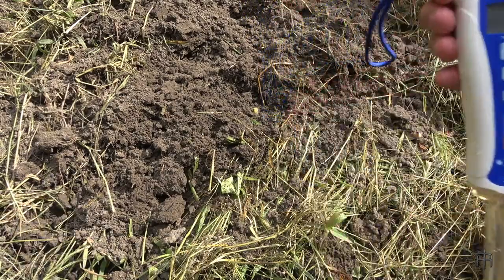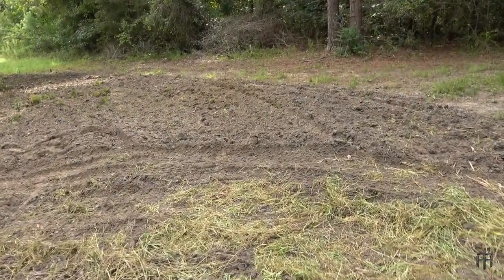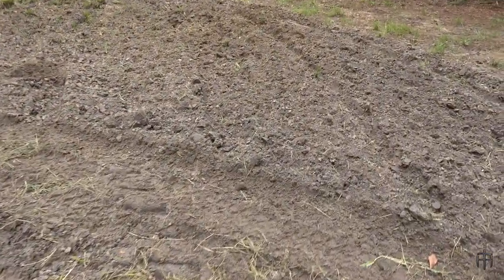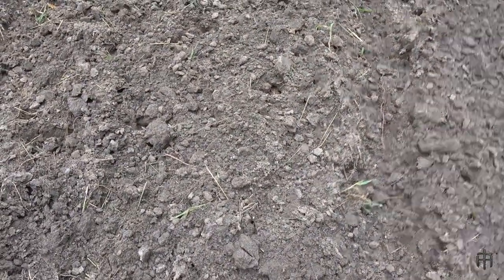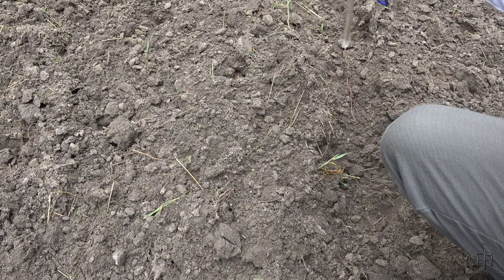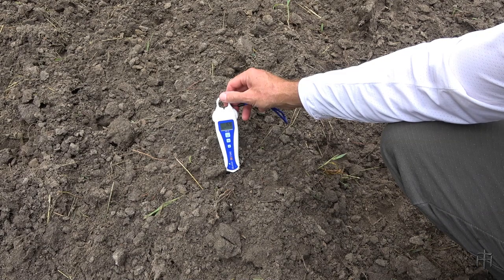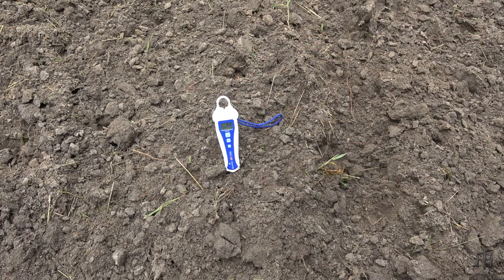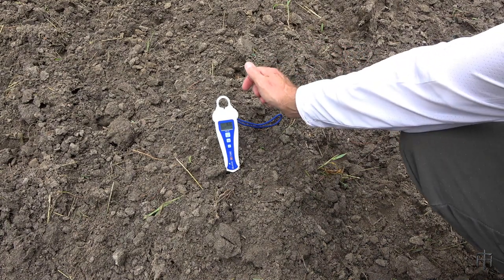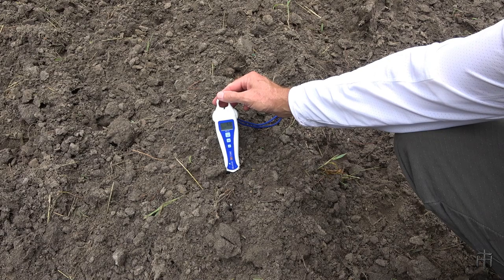Let's go one more — over here behind the cart, testing this fresh dirt right over here. See what we got. I went from 6.5 to 6.6 on that one.